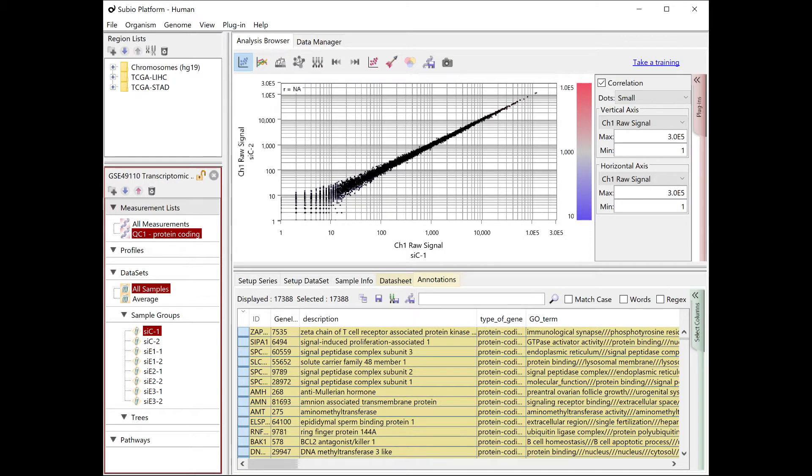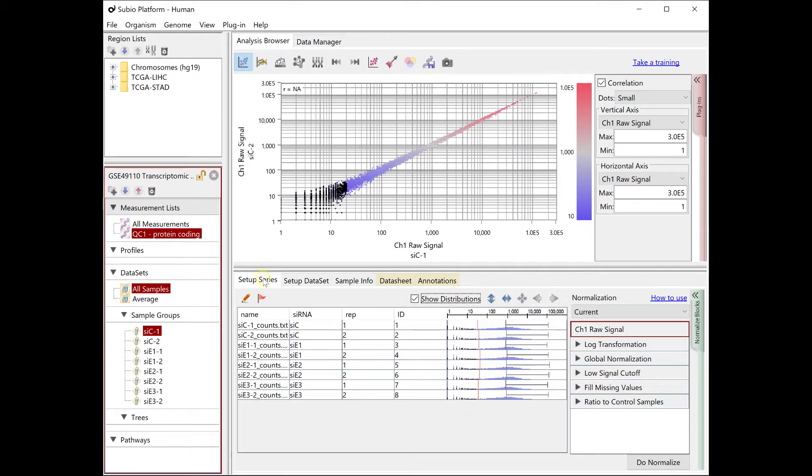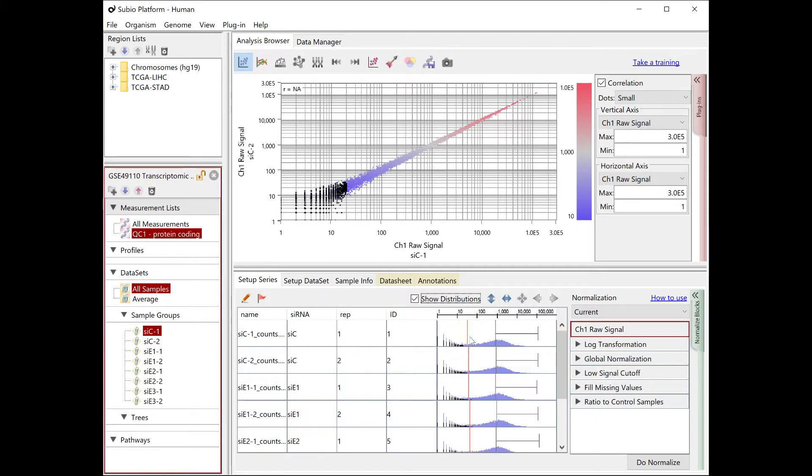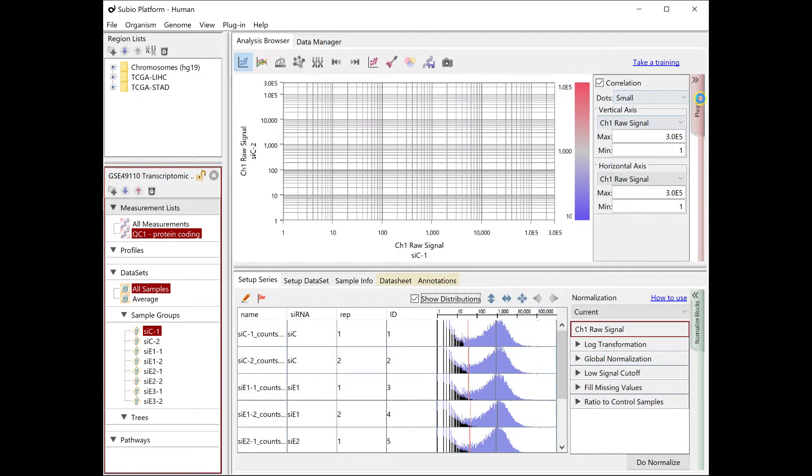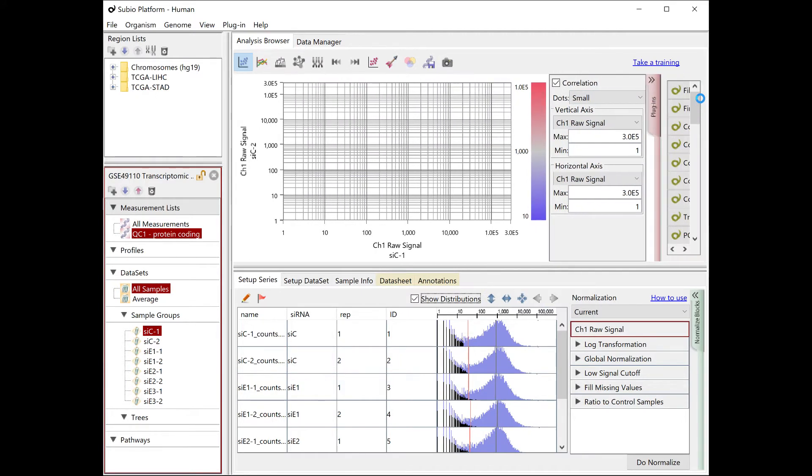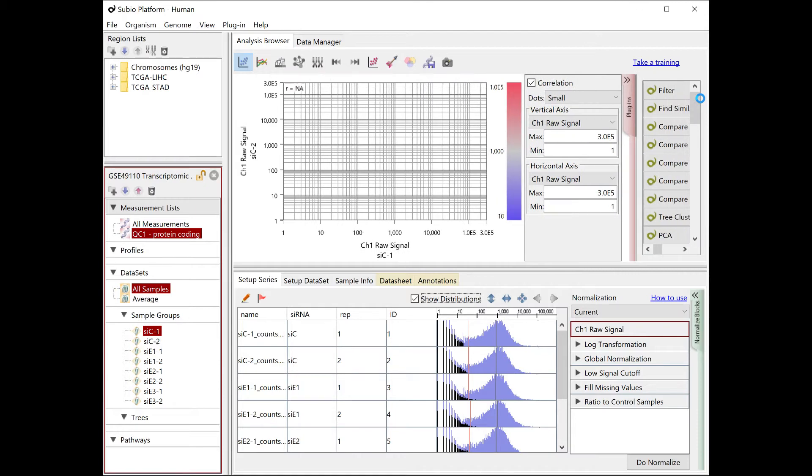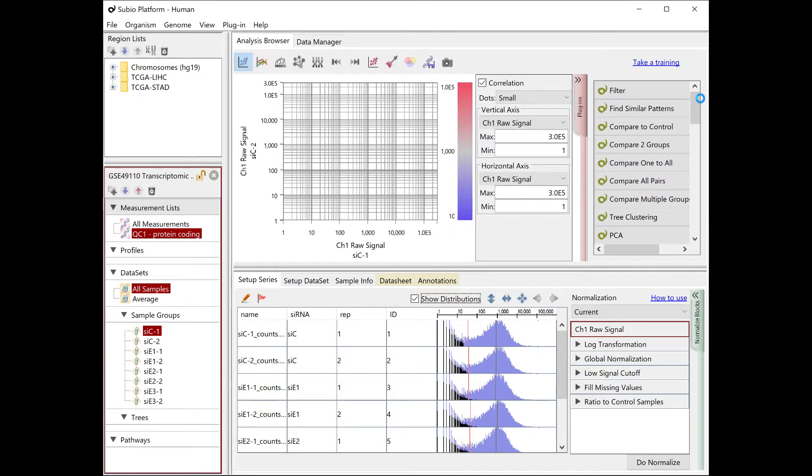Next, let's remove the genes in the noise region. Use the filter tool of the basic plugin. If you don't have a license, you can request a free trial.